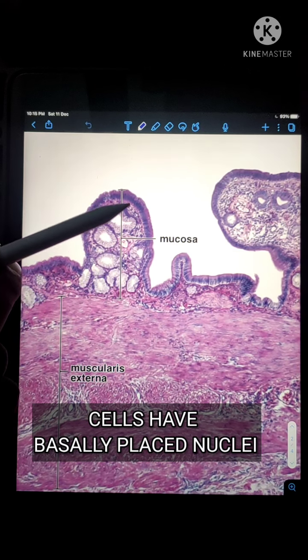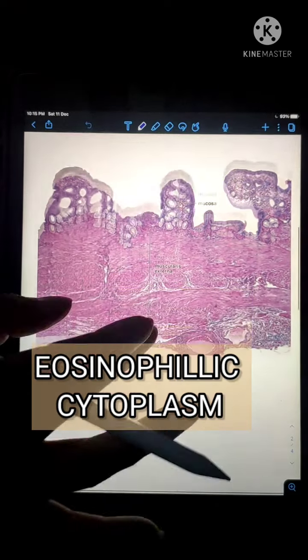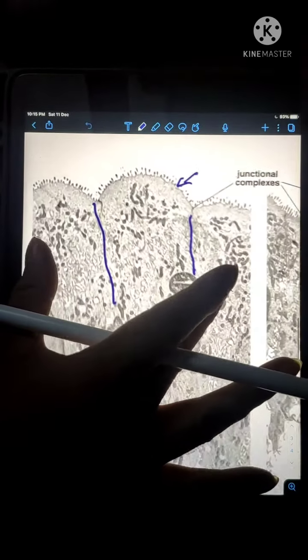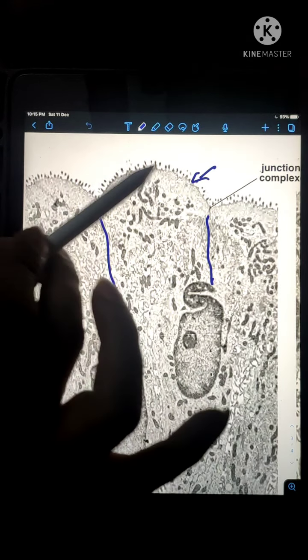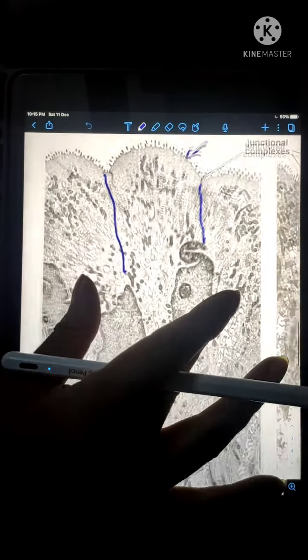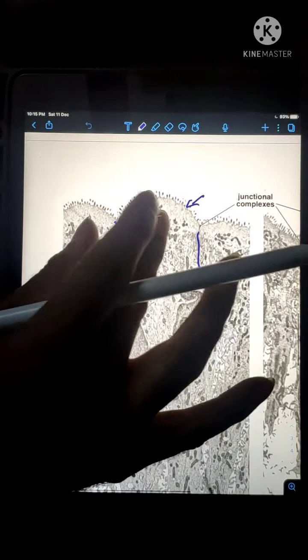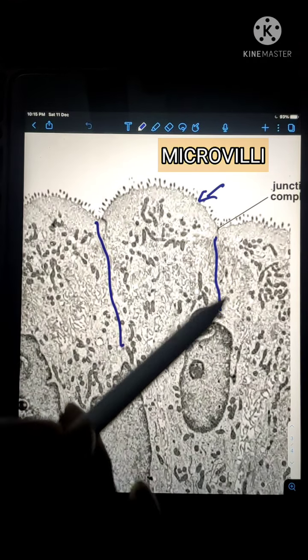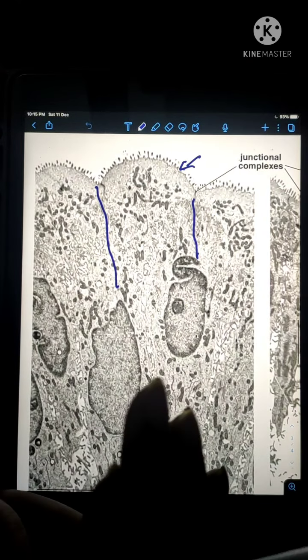The mucosal surface consists of simple columnar epithelium, and the apical part of these epithelial cells has microvilli. If we look at an electron micrograph of gallbladder cells, we can immediately see that the epithelial cell is a tall columnar cell. We can appreciate its length, and the apical part has modifications in the form of microvilli.